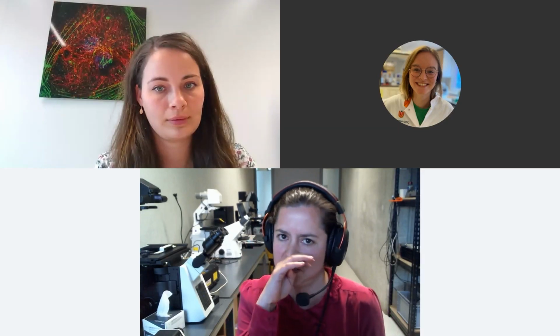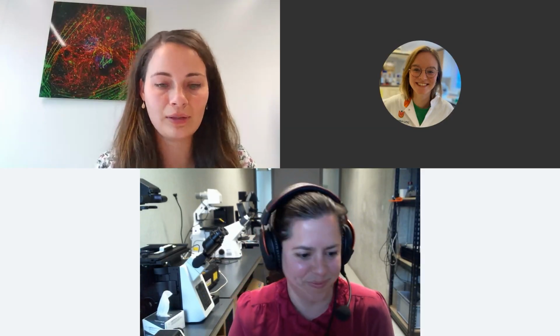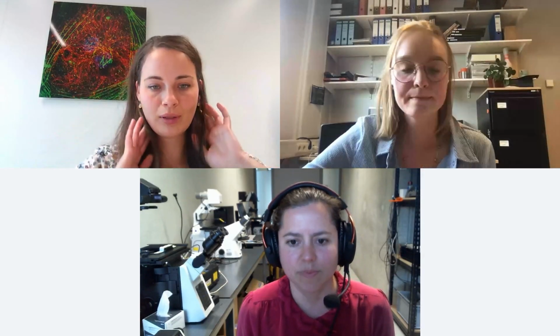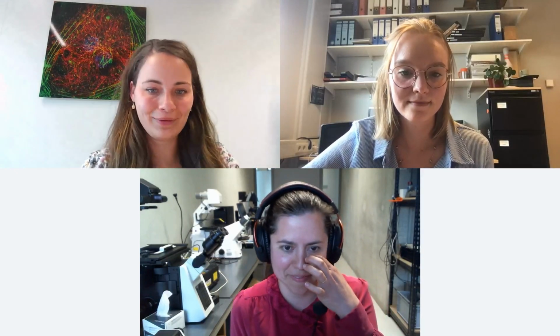I was working at 5 frames per second, but you can put it up to 25. Okay. And you compared the wide field image with the confocal one for the beginning? Yes.